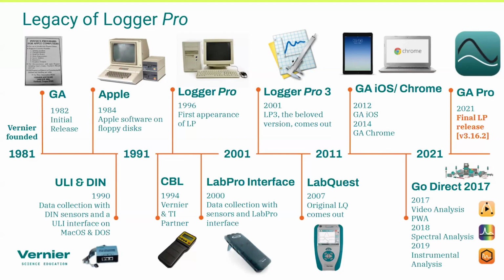In 2001, the current rendition of Logger Pro 3 came out, which has been updated many times since then, but that was the start of using USB, so I can connect my Lab Pro by USB to a computer and collect data. Again, that's really a way that we've been providing those things, and that was the trigger.